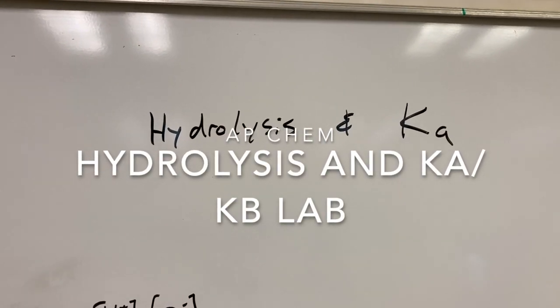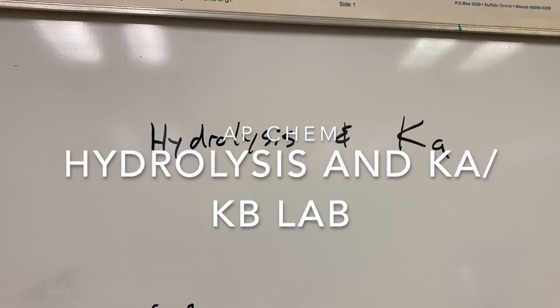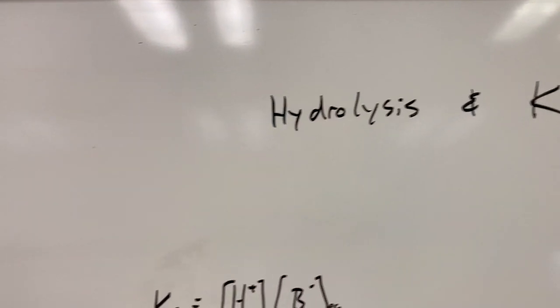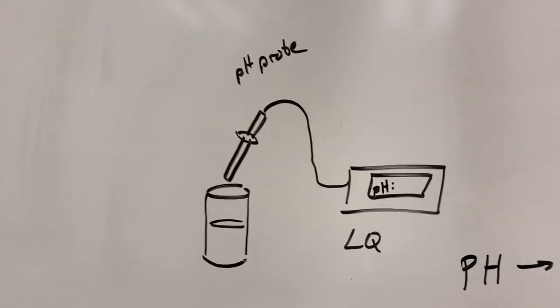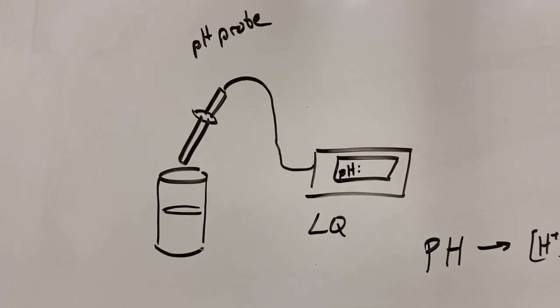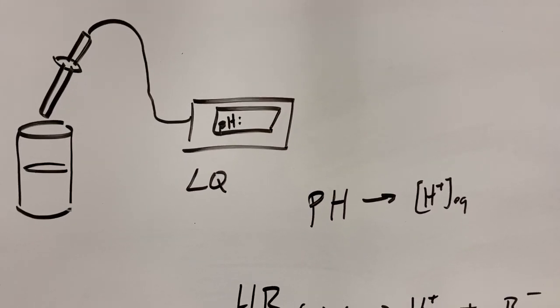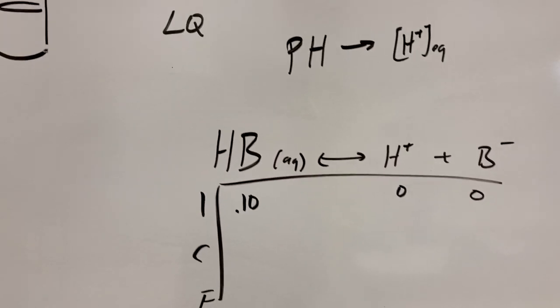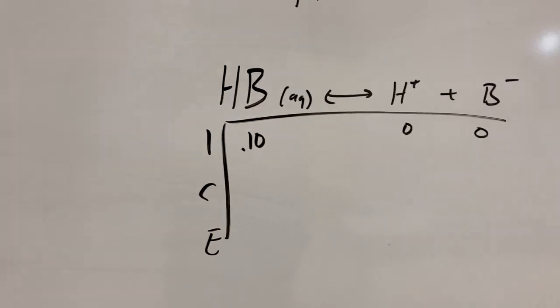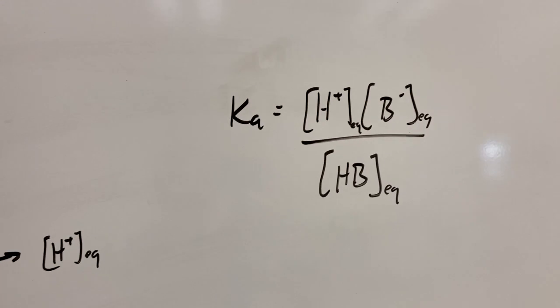All right, so this is going to be a pretty straightforward lab where we're going to test the pH of several different salts that are undergoing hydrolysis, and it's going to allow us to determine the Ka. So we are going to be using a pH probe. We're simply going to test a bunch of different solutions with the pH probe. It's going to give us a pH value. From the pH value, of course, we can get the concentration of H+, and the concentration of all solutions we're testing is going to be 0.1 molar. So that's going to enable us to determine equilibrium concentrations and thus determine the Ka value.